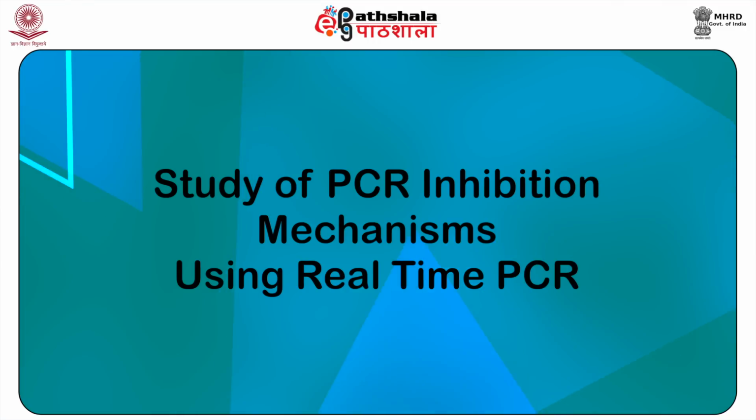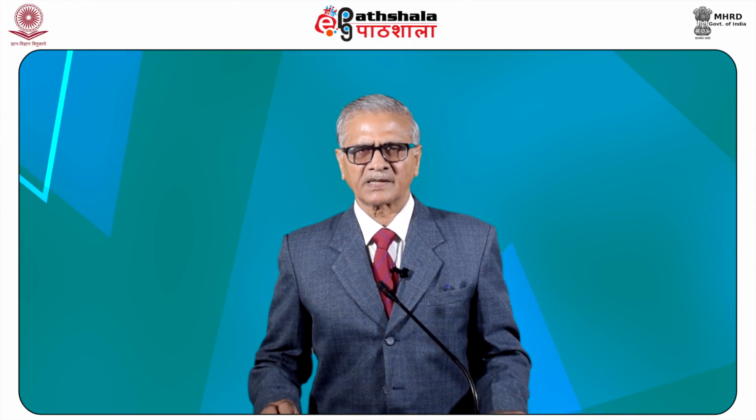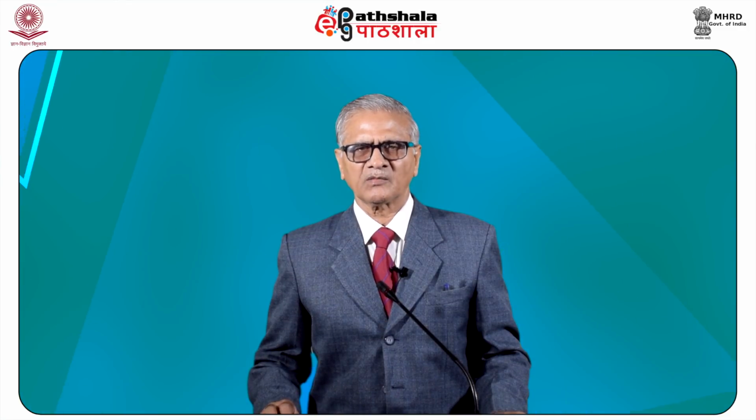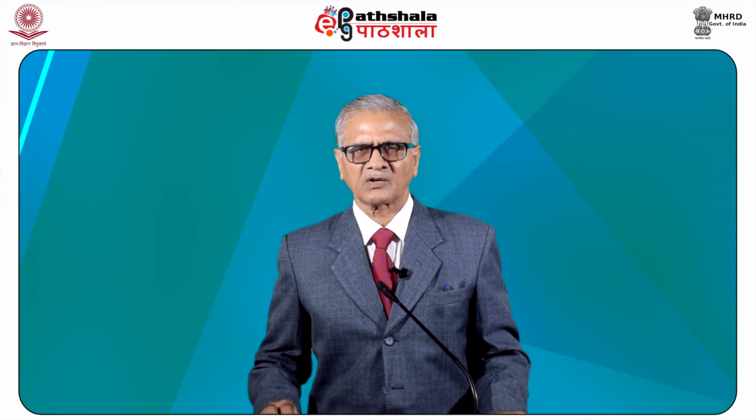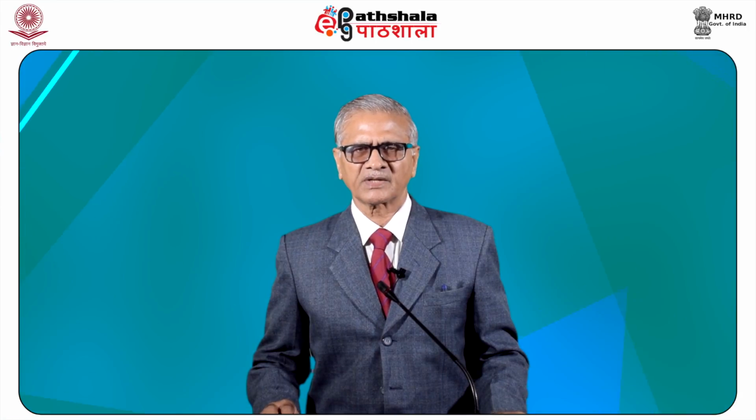Next is a study of PCR inhibition mechanism using real time PCR, carried out by Kelly L. Opel and others. They studied the mechanism of PCR inhibition by examining the effect of melting temperature, amplicon length and sequence. A single homozygous allele was selected and specially designed primers with 3 different amplicon lengths and 3 different melting temperatures were used to target the selected allele. Variable concentrations of various inhibitors were added to the reaction mixture to study the effect on PCR efficiency.